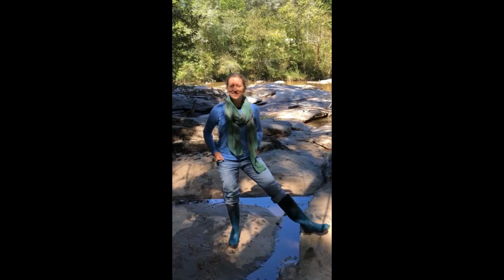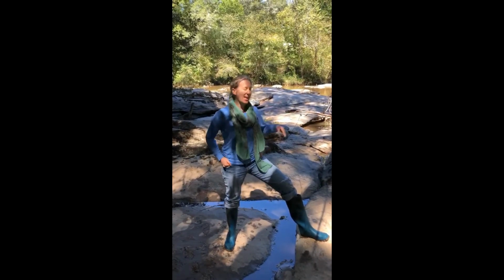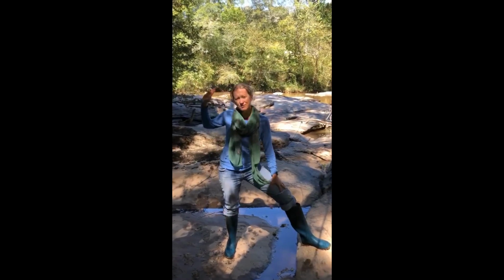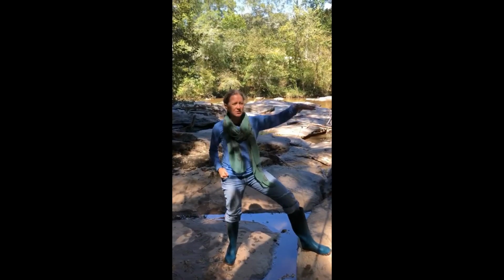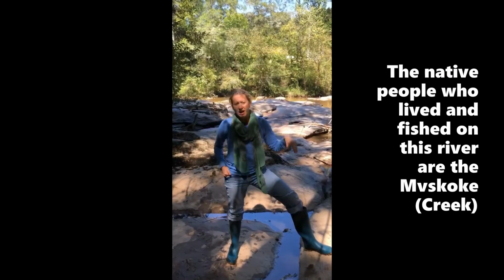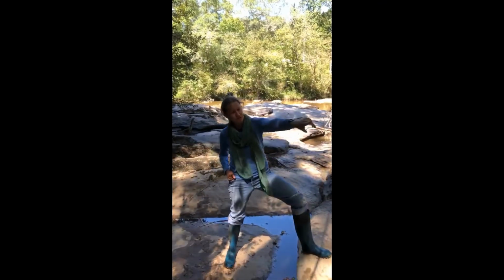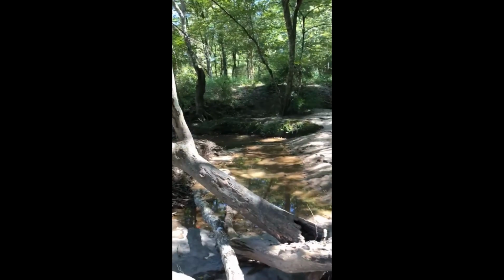We're at the beginning of our Winogradsky experiment at the middle of Coney. This is the upper part of the middle of Coney, right down from Bear Creek Reservoir. These are the shoals, and specifically where we're standing is a Native American fishing weir. Recently there was a lot of floodwaters that came through here, and so if you look over this way, there's a good deal of deposition.